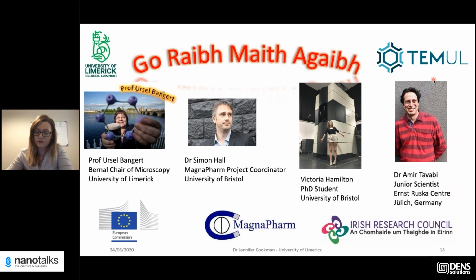Could you please explain more details about how you obtained the electron transparency mapping for measuring the thickness of the silicon nitride membranes? Yeah, so what we do, being really technical about it, is you have your holder in the microscope and you record what is being detected by the detector, and then we take it out without changing the electron beam at all and measure that as well. So essentially what should be hitting the top window of the holder will be what is hitting the detector without the holder in it.